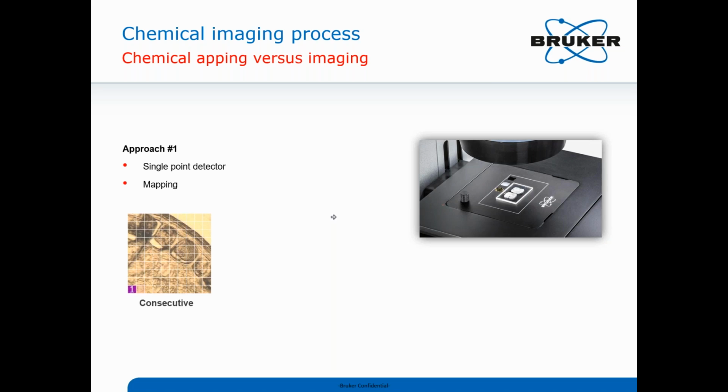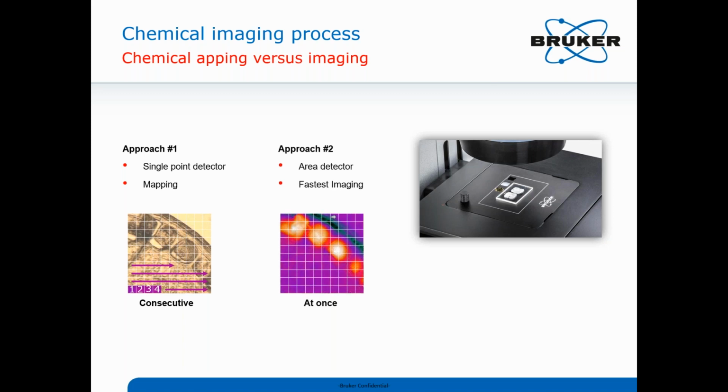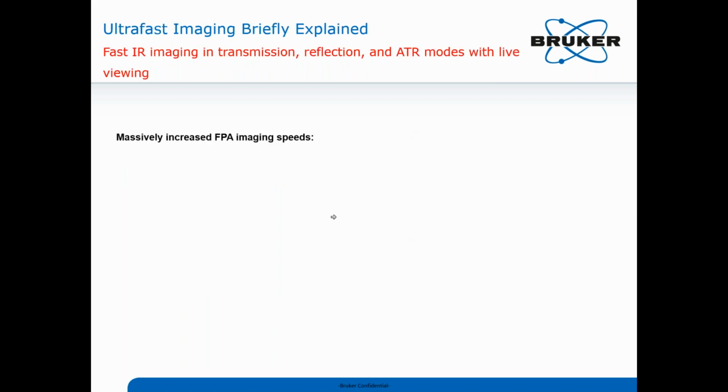So, okay, now I want to do imaging. I've done a few points. Now I want to do many points. And so I'm going to do them just like my iPhone. I can just do the snapshot of the image all at once. So now we can do that.